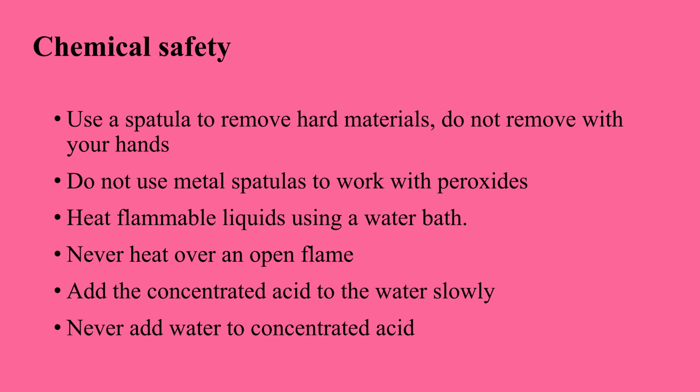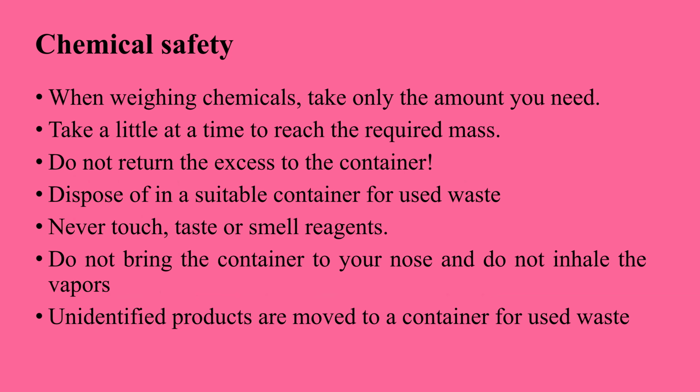Never add water to concentrated acid. It leads to splashing, and it's very easy to receive damage and chemical burns. It's not good.